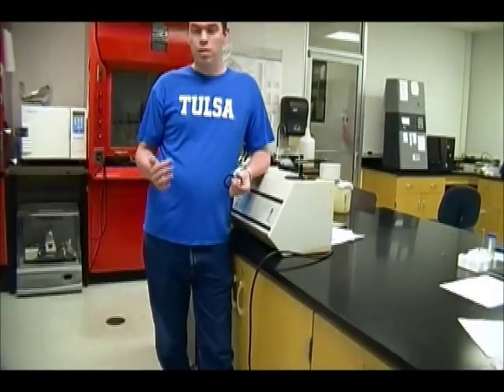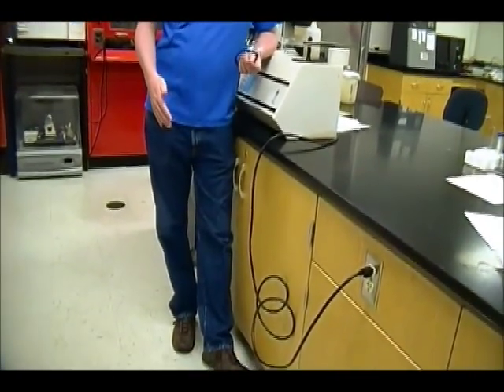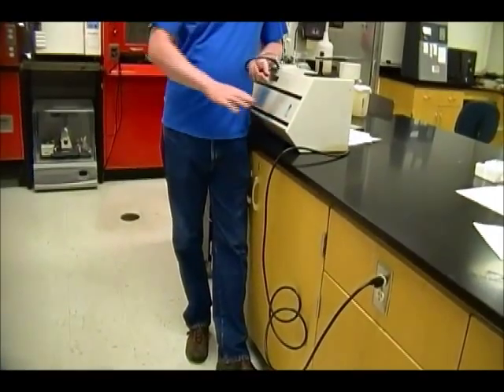Before we get to that, I want to cover some basic safety. You always need to wear the proper lab attire when you're running your experiment: closed toed shoes, no bare skin at the tabletop level, and always wear safety goggles while you're running the experiment. In this experiment, you're going to be using potassium permanganate in solution. It's going to be very pretty, very purple, and it will stain everything it gets on. So you probably don't want to wear clothes that you really like to this experiment. Just pay attention to what your lab instructor tells you.